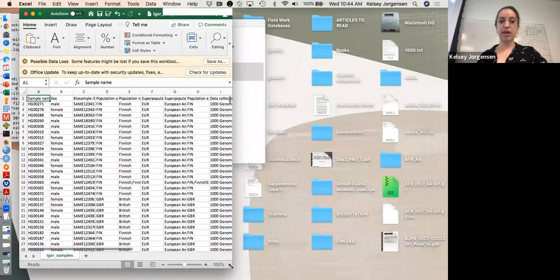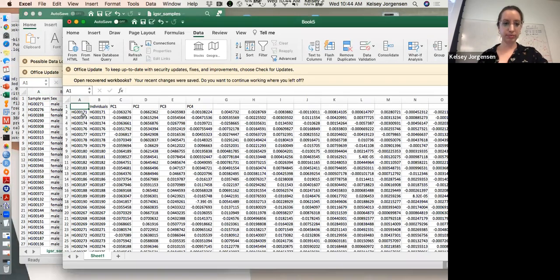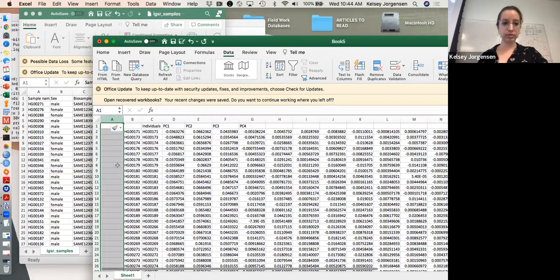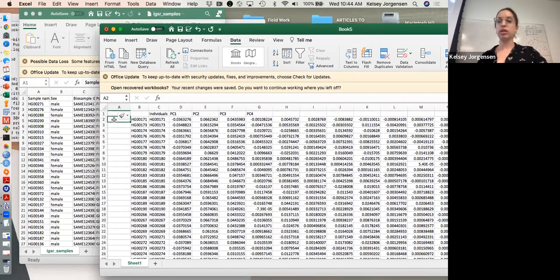Next, and I just have it open, right? Text to columns, space, yeah, finish. The issue was that all this data was all in one column. So in your blank column, then add back the PC1, PC2 names.